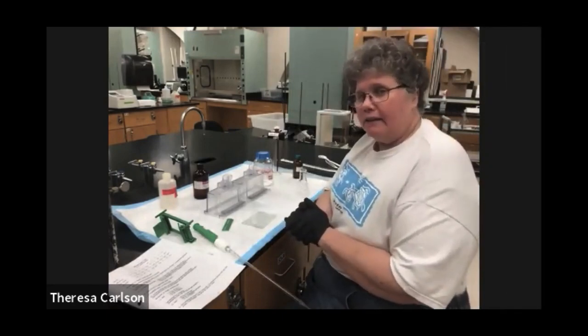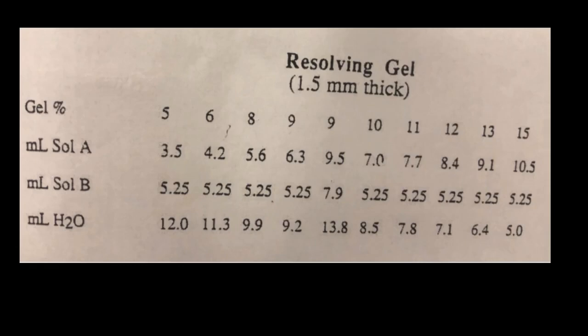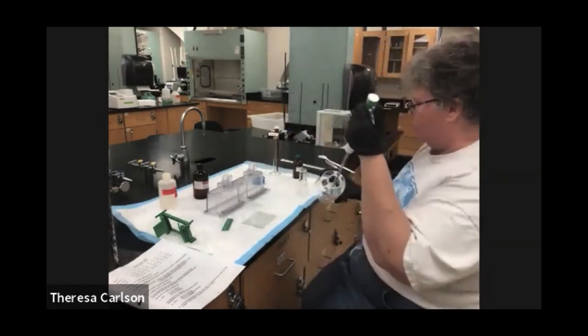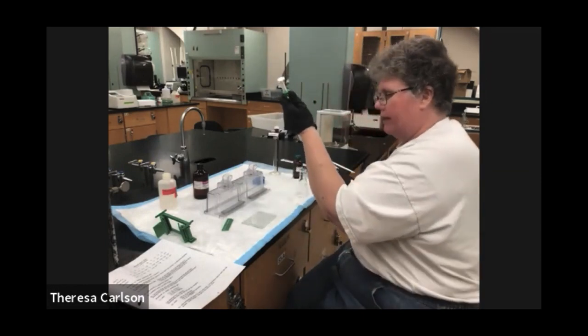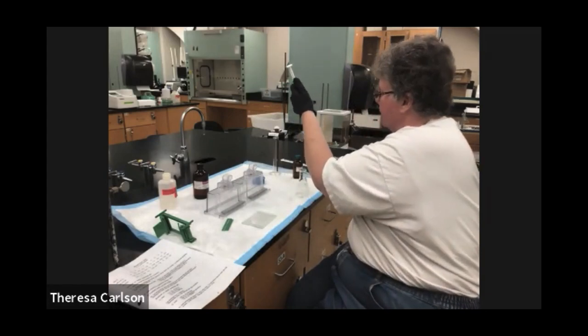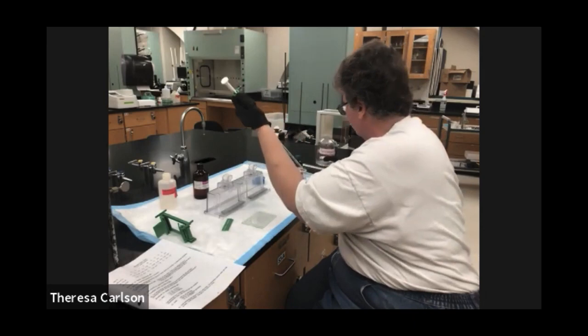Today we are making our SDS gel, and we have a recipe to make a 10% gel. That recipe is 7 mL of solution A. So I'm going to add 7 mL of solution A to an Erlenmeyer. Our Erlenmeyer already has 8.5 mL of water in it, because that's how much we're going to need. So 7 mL of solution A.